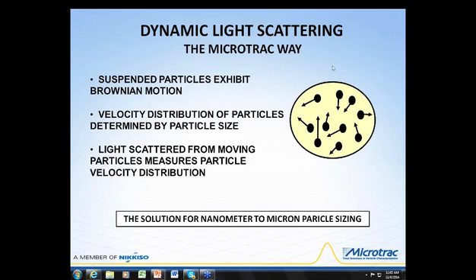The distribution of this motion, if it's thought of in terms of velocities, gives a determination of the particle size.